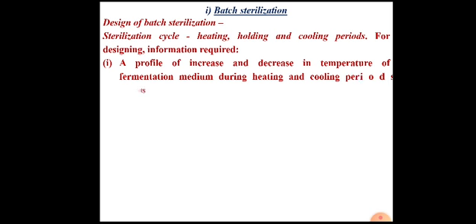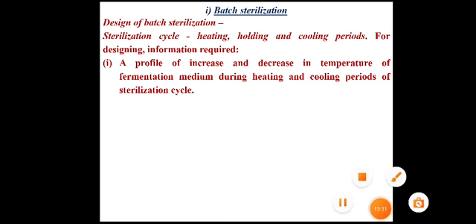First one is a profile of increase and decrease in temperature of the fermentation medium during heating up period and cooling down periods of the sterilization cycle. Why are heating up and cooling down periods important?